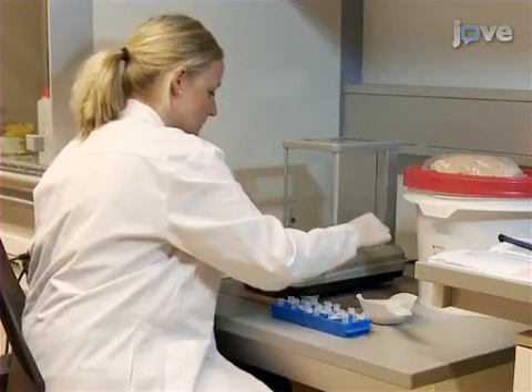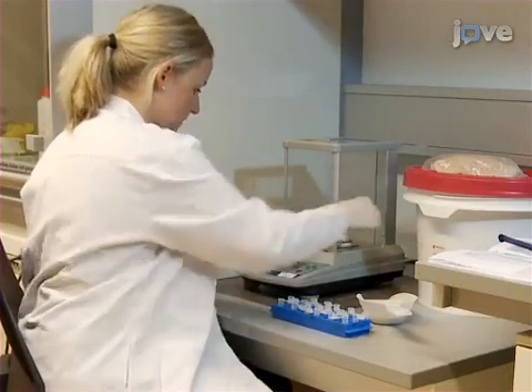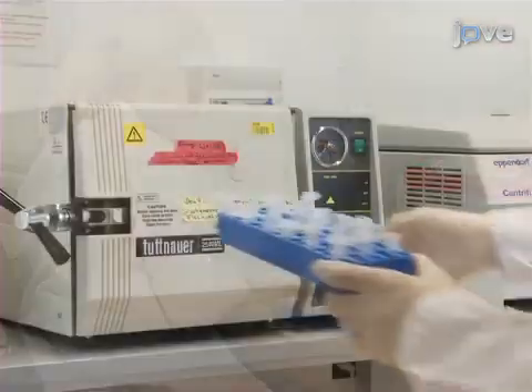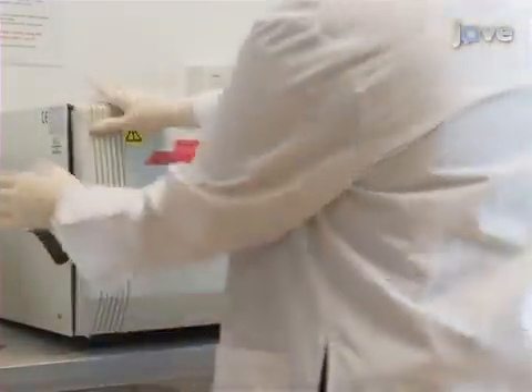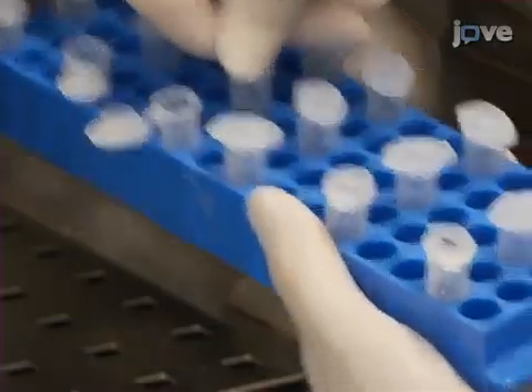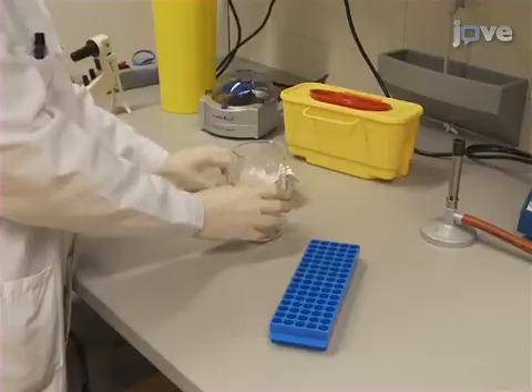Begin by weighing 50–80mg samples of chitin flakes in standard 1.5ml plastic tubes. Then, keeping the lids of the tubes open, autoclave the flakes. After the autoclave has cooled, immediately close the lids, and store the autoclaved chitin flakes at room temperature.